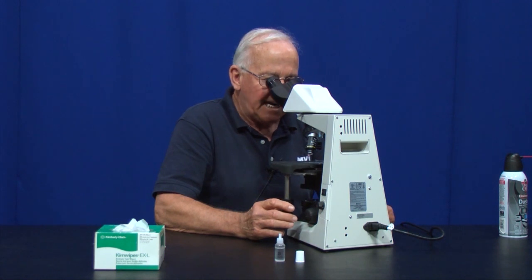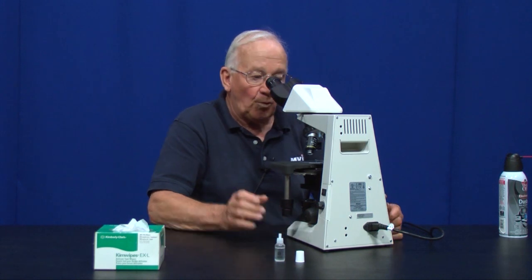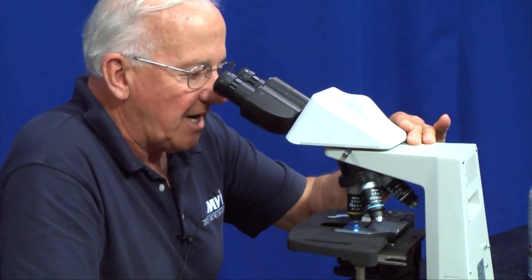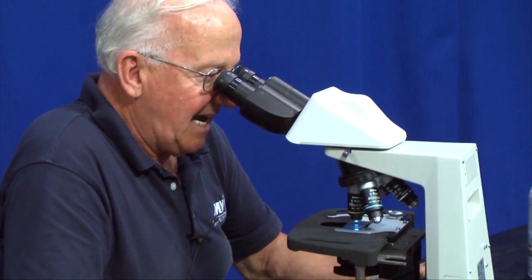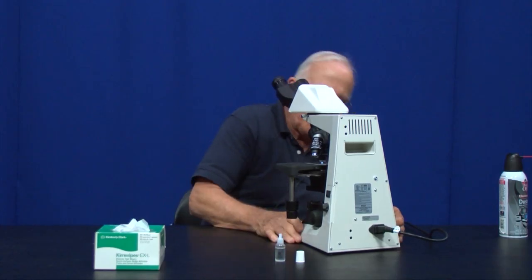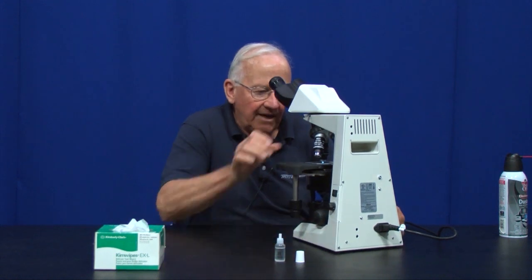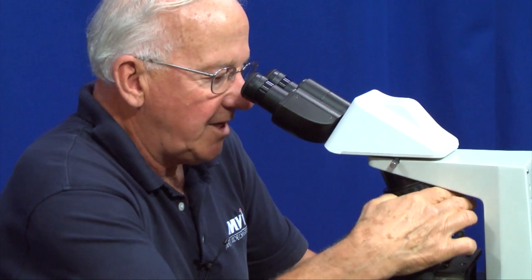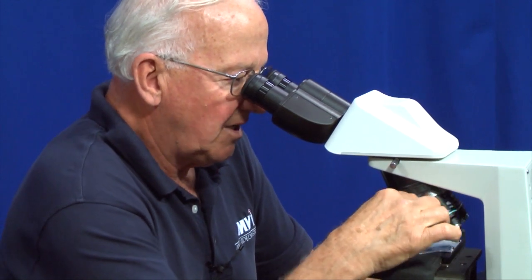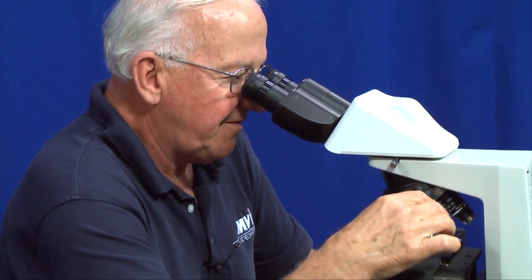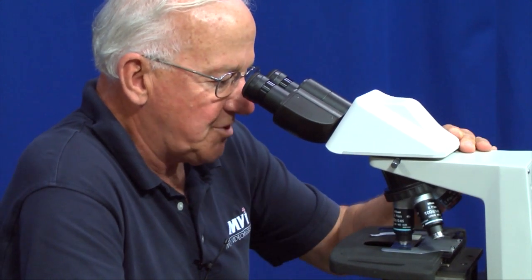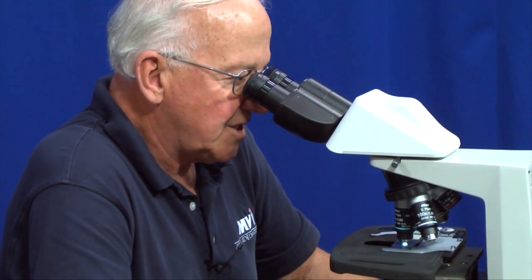Now we've got the slide. We have found the specimen using what we call the scanning lens. After that, we're going to go to the 10x objective and refocus a little bit. We have this specimen on the stage now and we have the eyepieces set. We started with the 4x objective, went up to the 10x objective in focus, and we're going to go up to the 40x objective. Focus is beautiful.